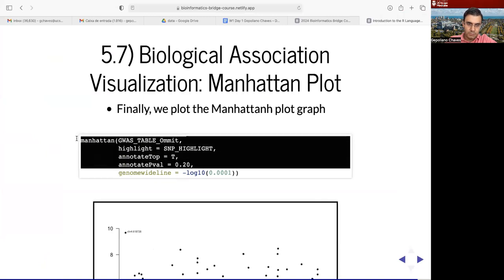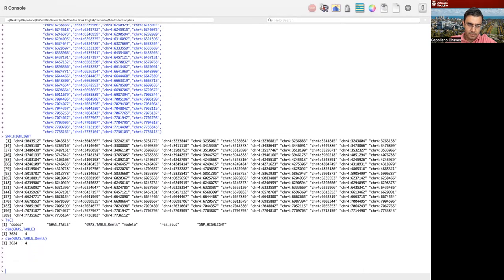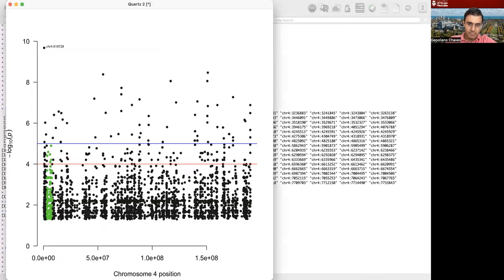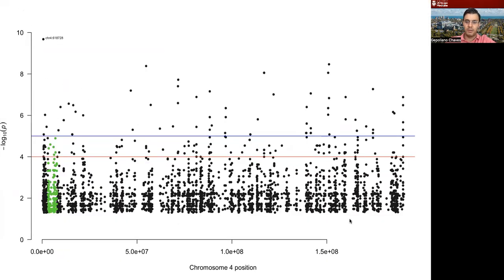Okay, so I'm going to just copy this. And there you go. We have plotted the Manhattan plot.